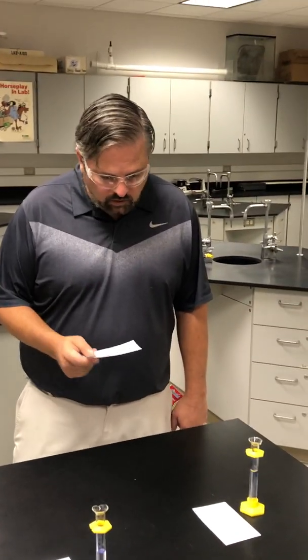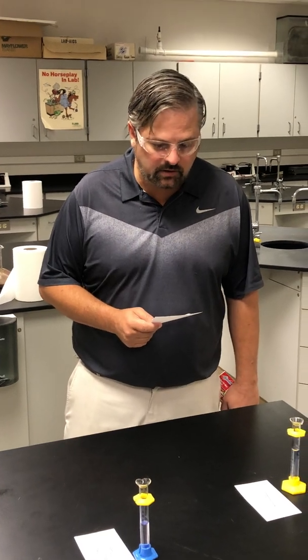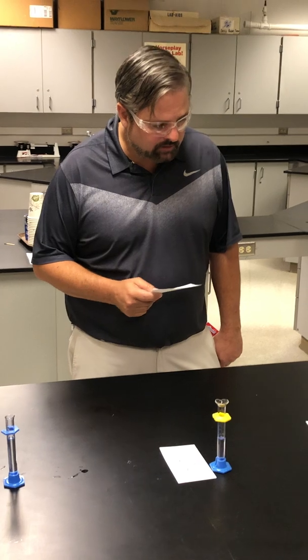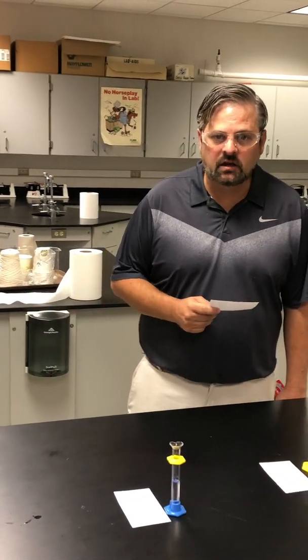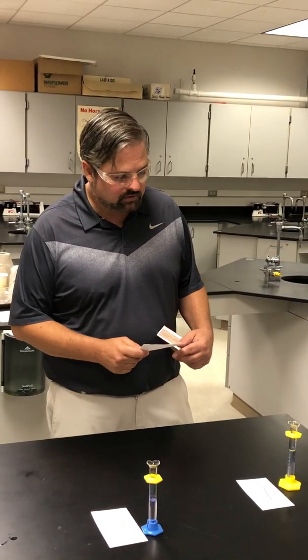Okay, so we're going to just make these observations. Obviously, normally you would make them yourselves, but it's not possible because of the COVID. And so I'm going to describe some of the physical properties. You're going to write them down and then indicate whether they're intensive or extensive physical properties.